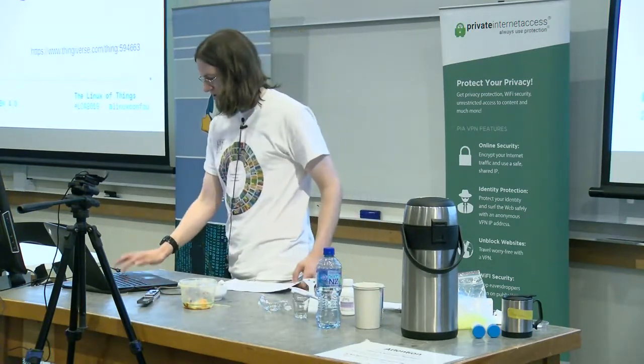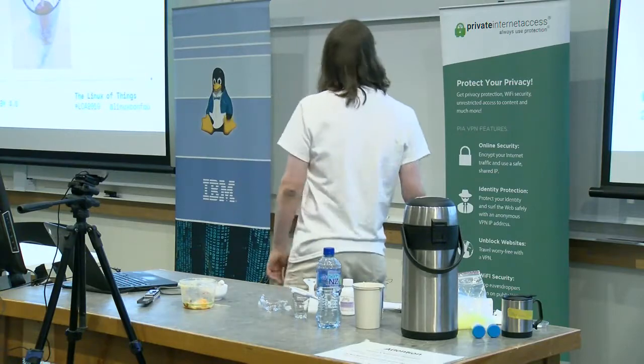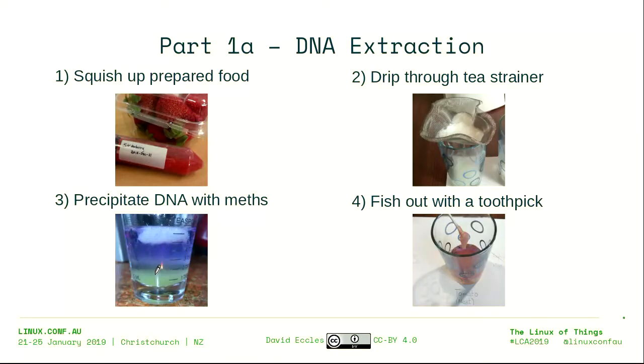Okay, here we go. On this slide are my instructions. What I'm going to try to do is extract DNA from a food that I got at a cafe on campus. This was my lunch from yesterday.